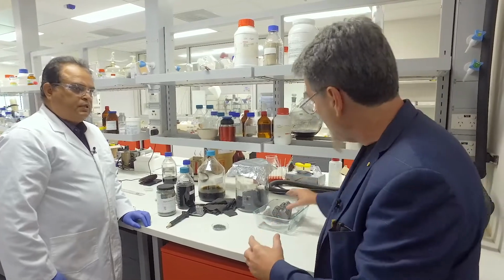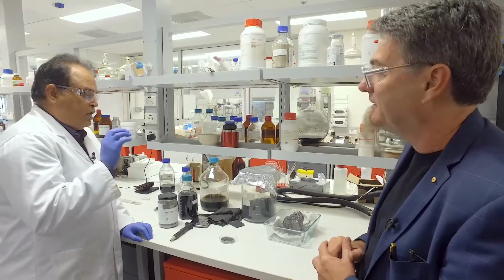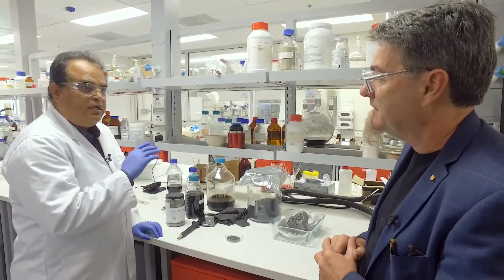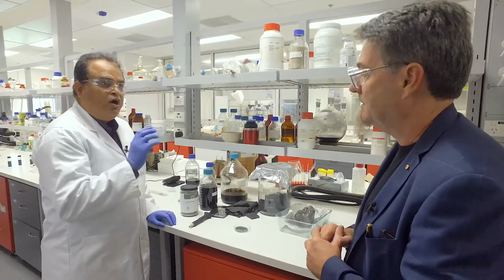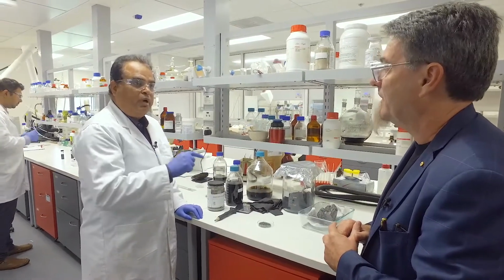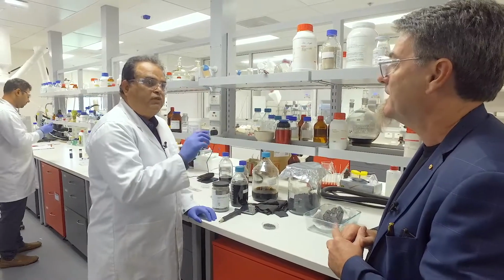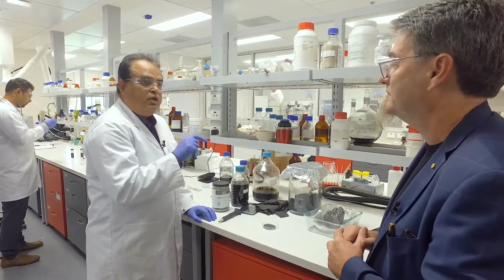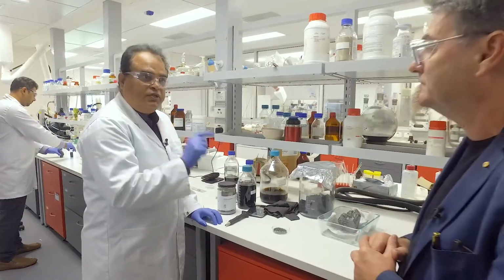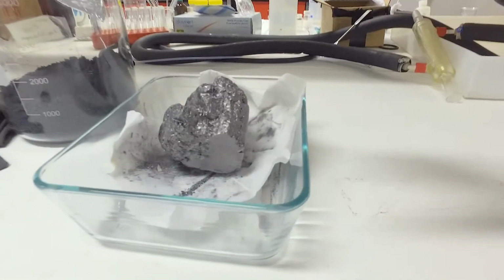How do we know how pure that graphite is, or what the properties of the graphite are? We have been characterizing this material by CHNS analyzer, how much is the purity of this material, and also checking the impurities by trace metal analysis, how much is the metal impurity, which are very, very important, how much is the impurity content in this one. Once we ensure the quality, then we start processing the material. And so we take this lump of graphite, yeah.